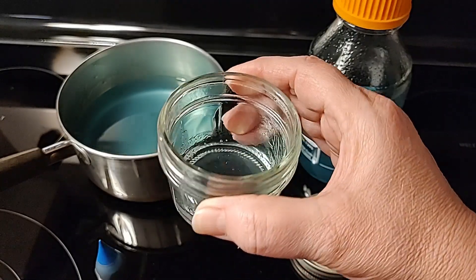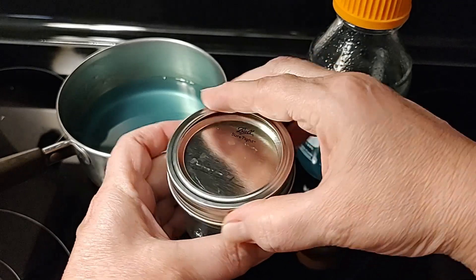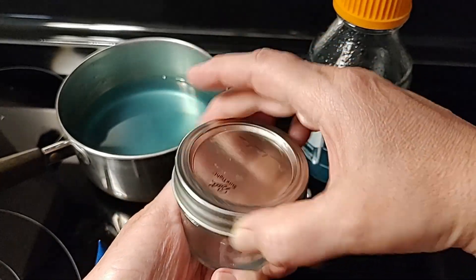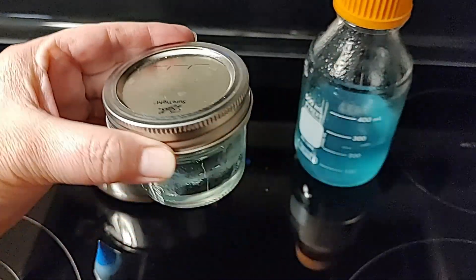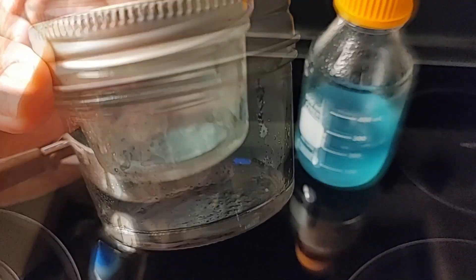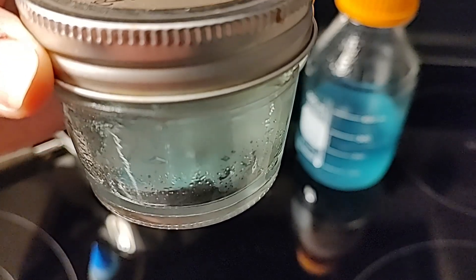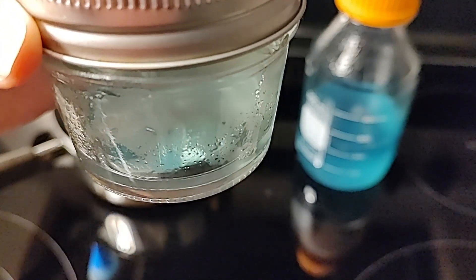So we do a water agar, an MEA, and an MYA. We color those in three different colors so we know which dish we're looking at, making it really easy to not confuse which recipe or agar dish you're looking at. This here in the video is an MEA recipe with the blue food coloring.